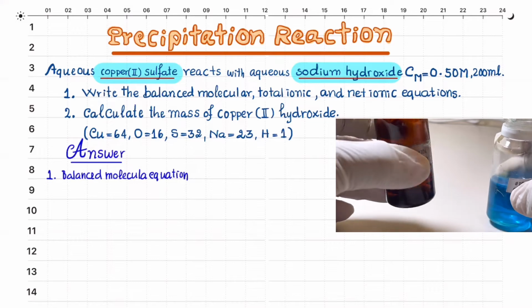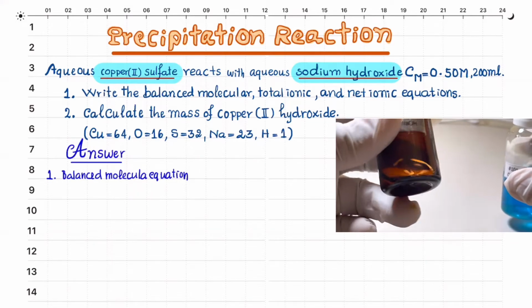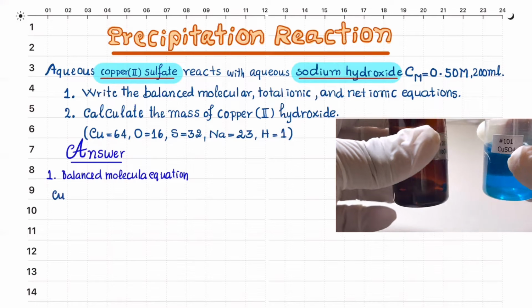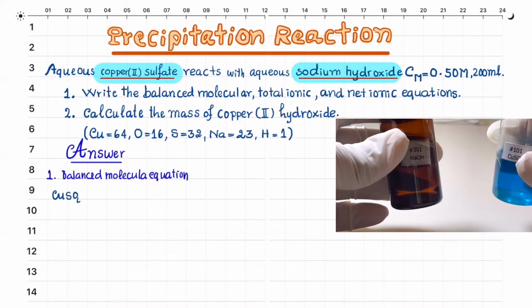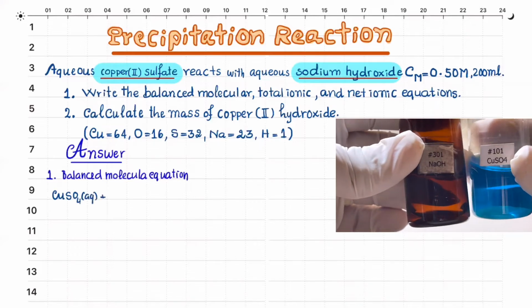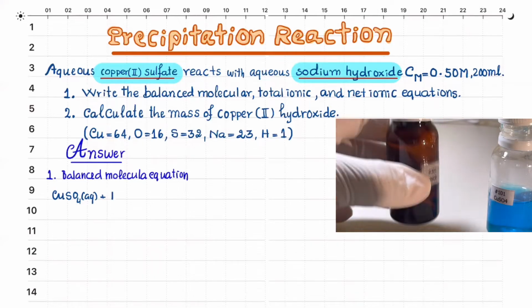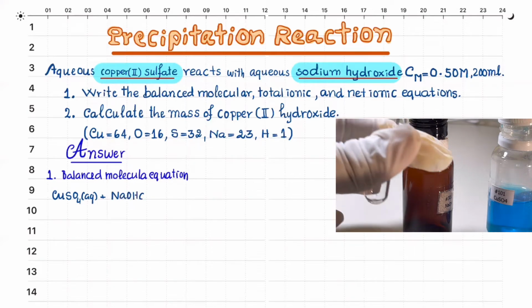Copper(II) sulfate, CuSO4 aqueous, plus sodium hydroxide aqueous.